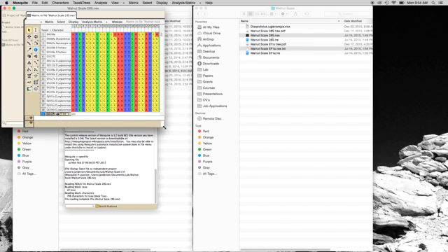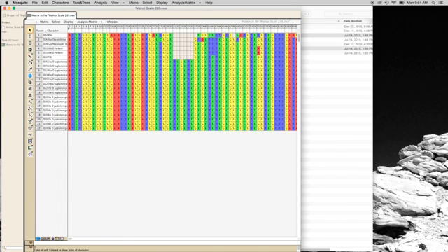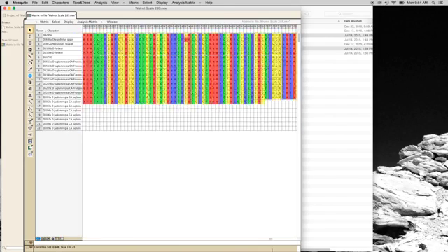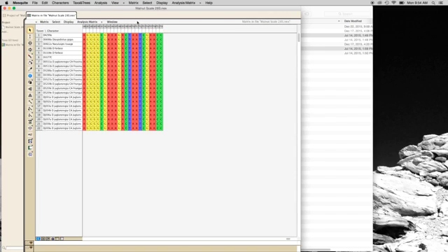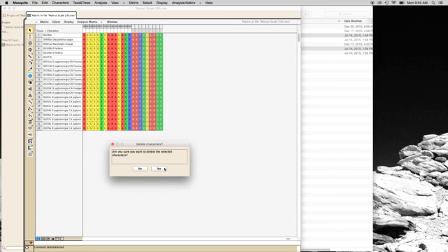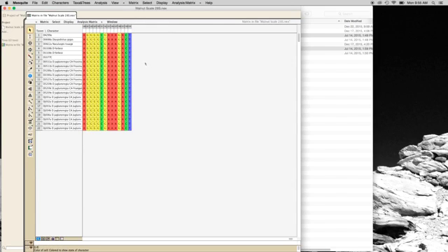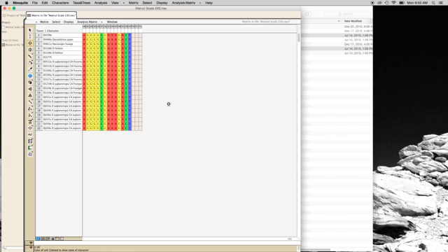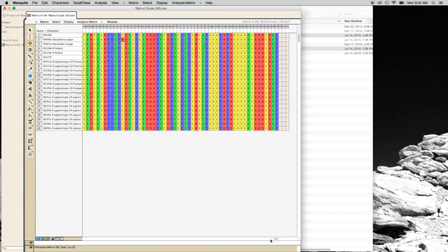We've got our nice alignment. We've got our taxa names. And I've already truncated the data set so that it's got blunt ends, but if you wanted to, now would be the time where you would remove characters, so you'd have a nice clean truncation to your data set. I also find it's useful to insert a few gap characters just so that when you concatenate the second gene region, you have this visual space so that you know where one gene starts and where the next ends. There's another way to take care of that, and I'll show you in a second.